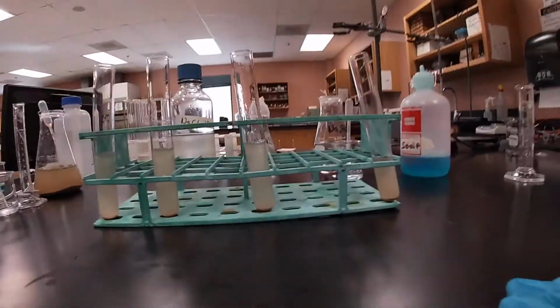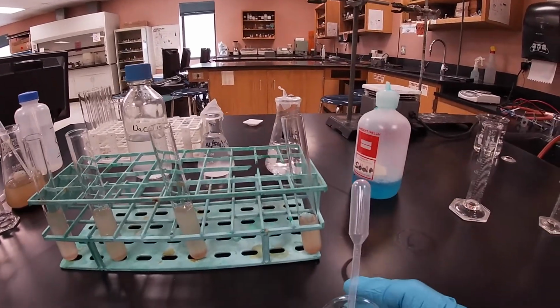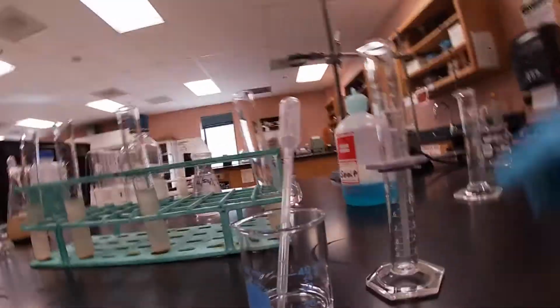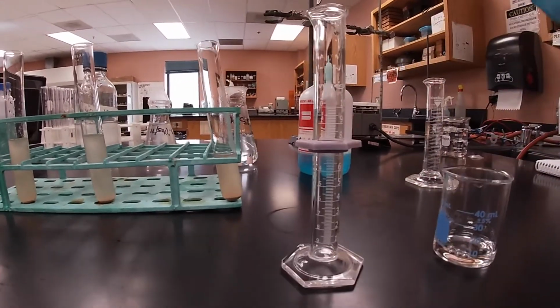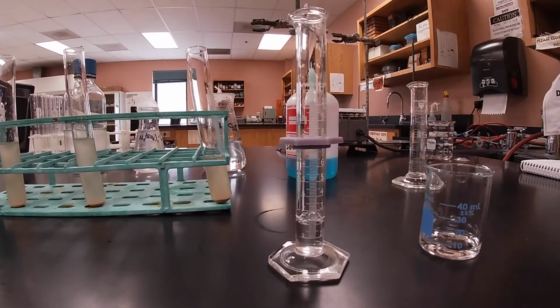And then we'll continue with our last one, which is our sodium sulfate. Here we'll get our last graduated cylinder. And here we'll record. We'll continue with our additions of 5 milliliters.